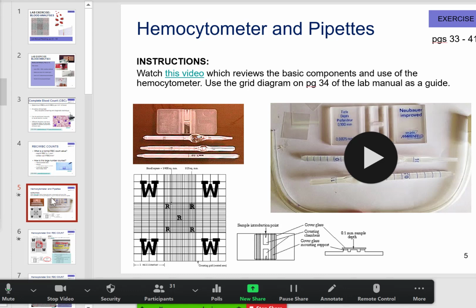You're not going to believe this, but it's true. When I first started at Saddleback, the students were doing these dilutions. They were diluting my blood. And the instructor before me, her blood. And the students were using these mixing pipettes. That's the glass rods you're seeing in front of you. They were mouth pipetting these blood dilutions.